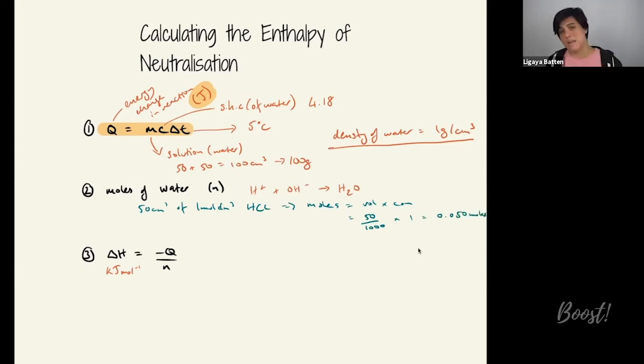If we had that many moles of hydrochloric acid, we can do the same thing for the alkali, the sodium hydroxide, if that's what we were using. Obviously, all of this depends on what the actual solutions you are using in the experiment are. And you also have to be careful of whether one is in excess or not.